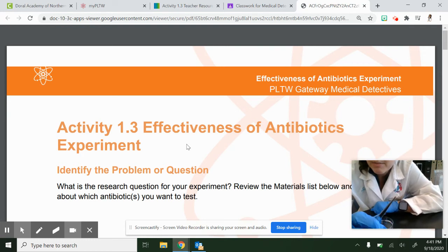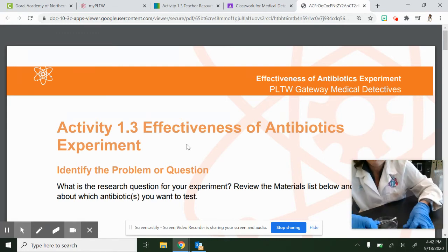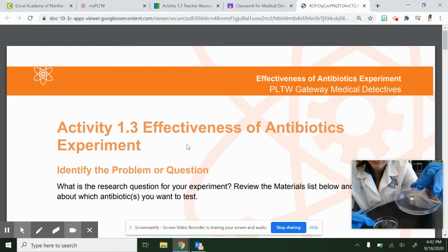So the discs are going to be your choice of antibiotic or multiple antibiotics, and then you'll have a blank disc, okay? And they will all just be hanging out in the top of this lid until you have everything ready to go that you want to use. In between each antibiotic, make sure we're sanitizing that set of tweezers.